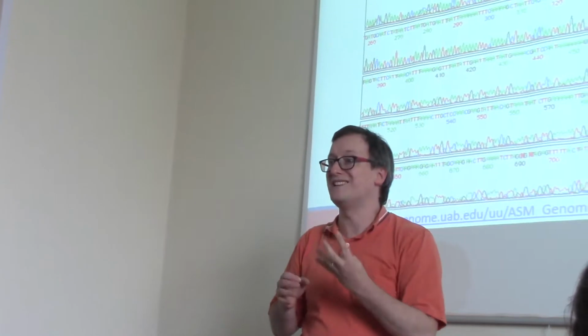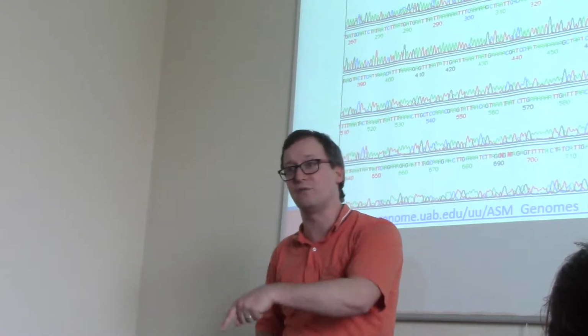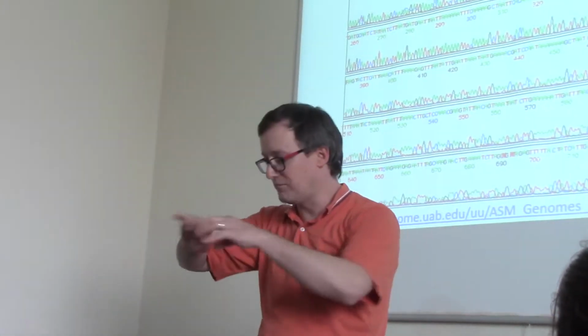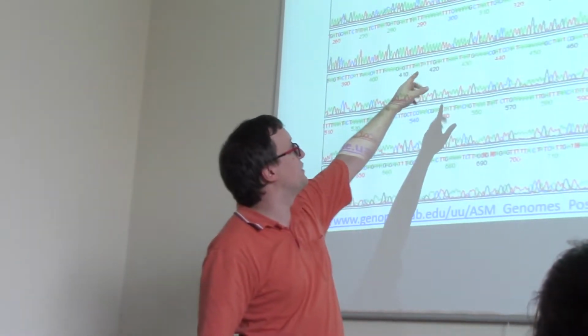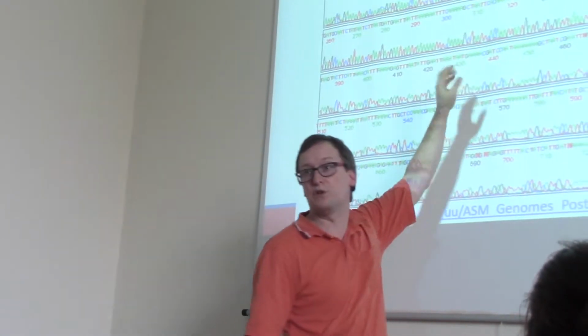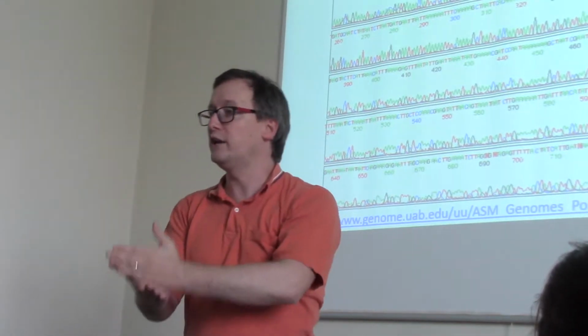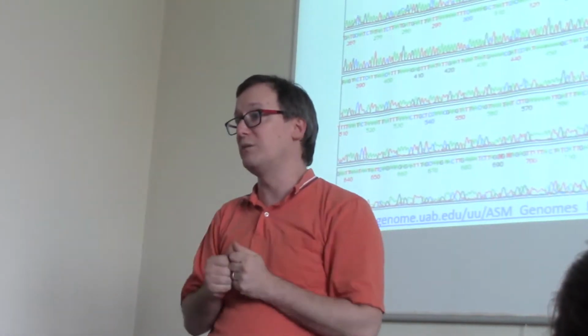So that's grand. We're measuring 4 different intensities, each associated with a different dye, as these products of polymerase are flushed off of the capillary electrophoresis column. Now, if you look at the electropherogram around 300 or 200, you're kind of looking in the sweet spot of these runs. You have a nice rise and fall, and when the signal in fluorescence falls, it falls all the way to the baseline, so that we have completely resolved neighboring peaks for neighboring nucleotides.